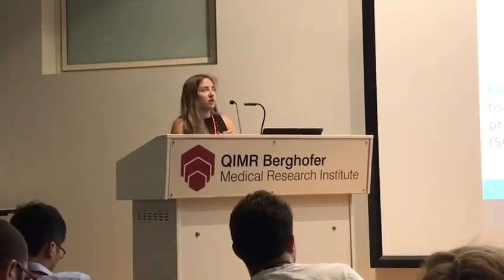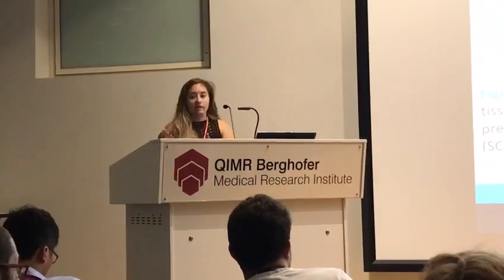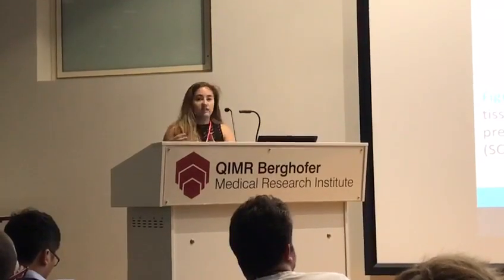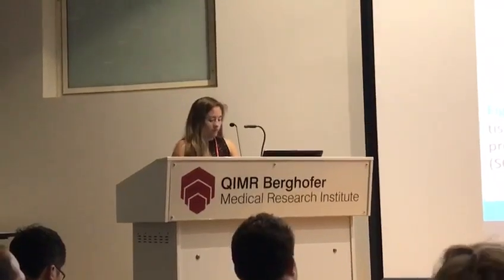The results that we got were proteins matching with UniProt accessions of the mollusca proteins or IDs of the transcript. But the difficult part was that the ones that matched with the transcript were not annotated, so we needed to do a BLAST alignment.